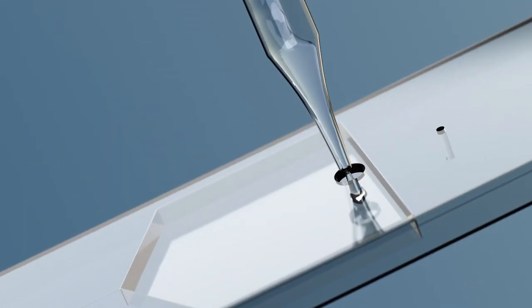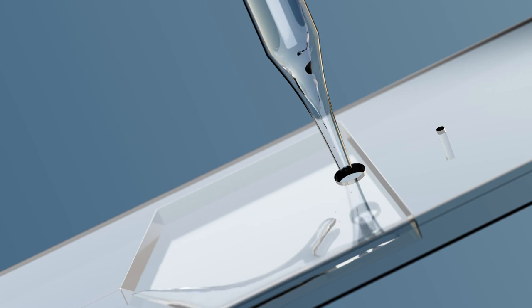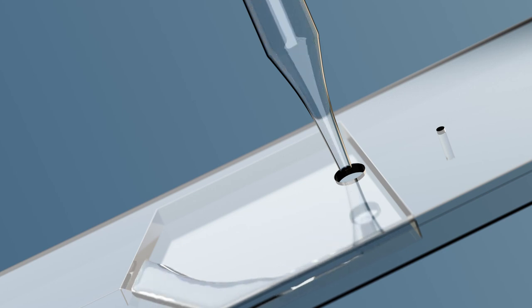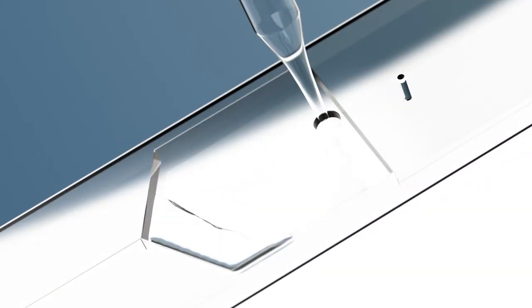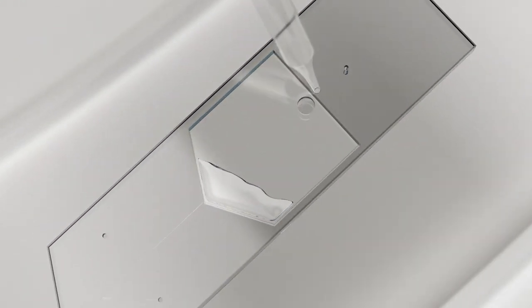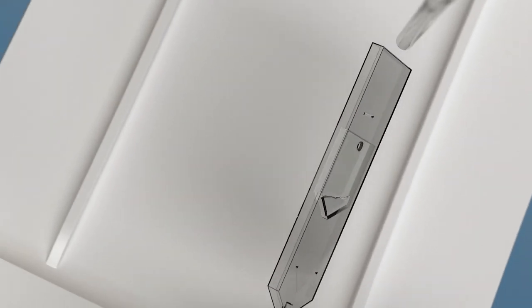Cells in media can be directly loaded into the cell cartridge and then inserted into its holder.